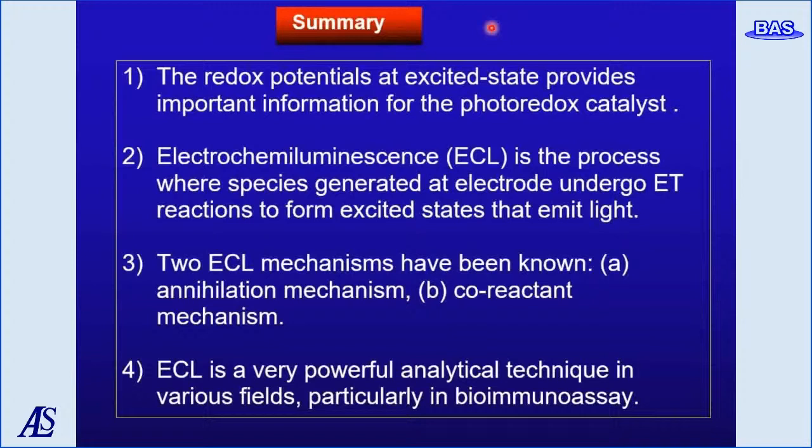Related to the excited state, I also talked about electrochemiluminescence. It has two ECL mechanisms. One is the annihilation mechanism, and the other is the co-reactant mechanism. ECL is a powerful tool for bioimmunoassays.